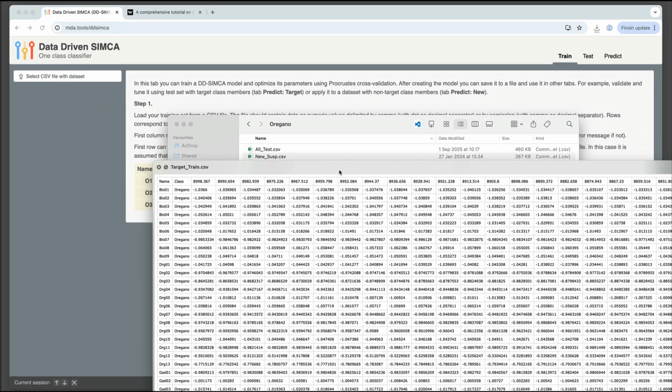And now you see that if you train your model, it's very important to provide your data as a CSV file where there is a column with classes. For example, in my case, I have a column with labels for every row, so unique object labels. I have a column with classes, and then I have these predictors, right? These are the spectra in this case. You can also see that I have wave numbers as a header, as variable names. This will be needed when you load the data. But the most important thing is this one. You need to have the class label for training and for testing your model in your data. So that's the most important.